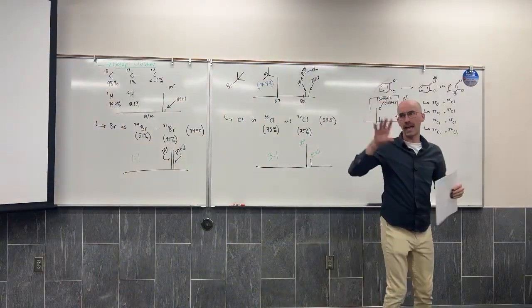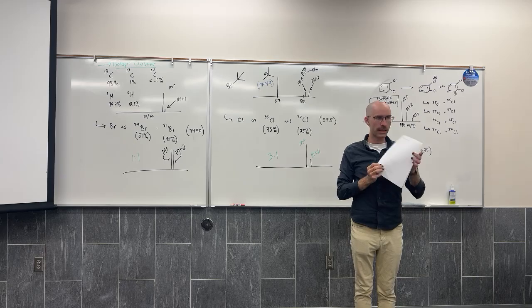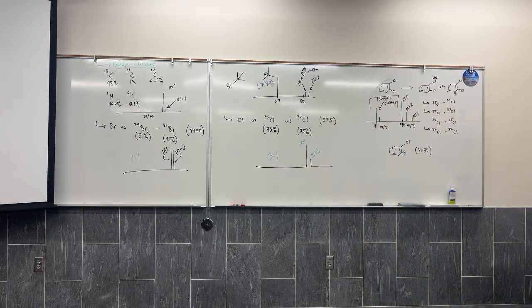If I don't give M minus over the relevant peaks, then I will typically write the signal over the peaks. Now I know that we're running out of time, so I don't think you guys will be able to do this in class. I'll post an answer key with this. But I thought I'd give you guys practice problems determining structure from spectra.